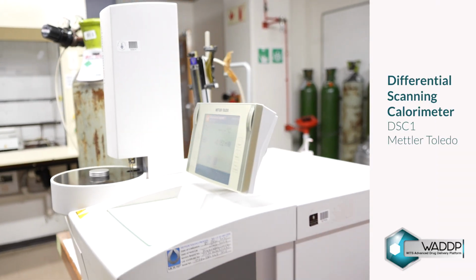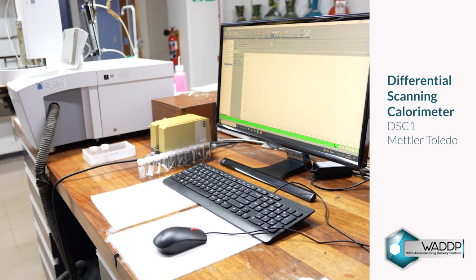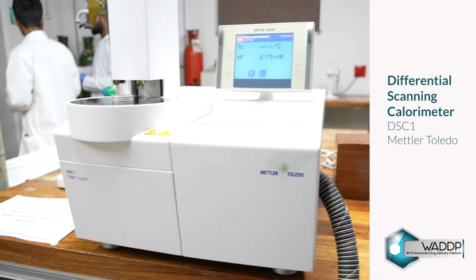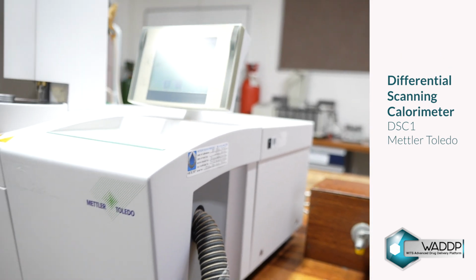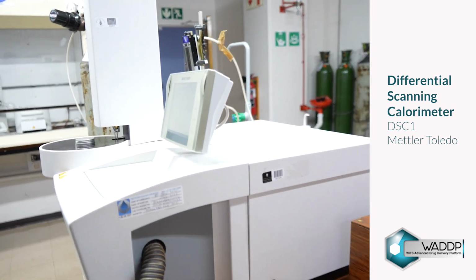Differential scanning calorimeter measures the heat flow into or out of a sample as it is heated, cooled, or held at a constant temperature, isothermal, allowing you to detect thermal transitions in materials.